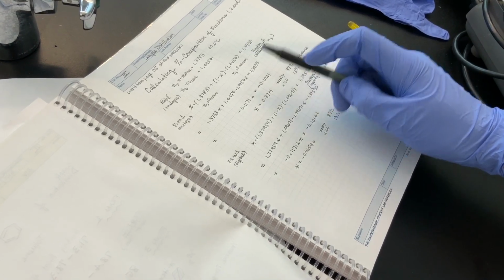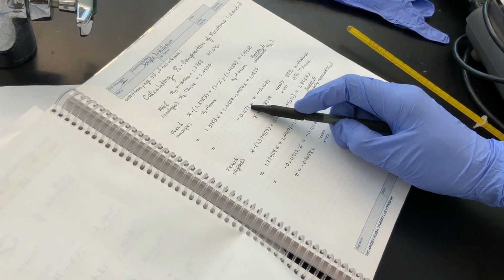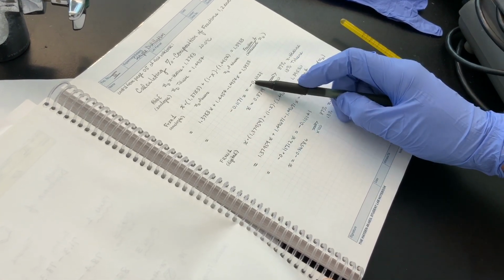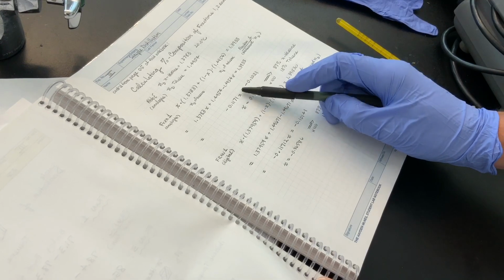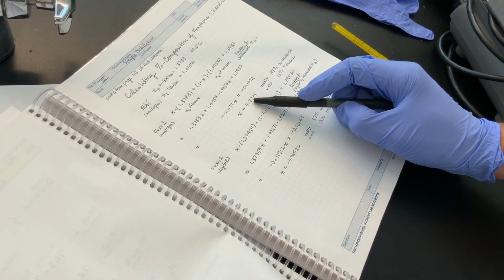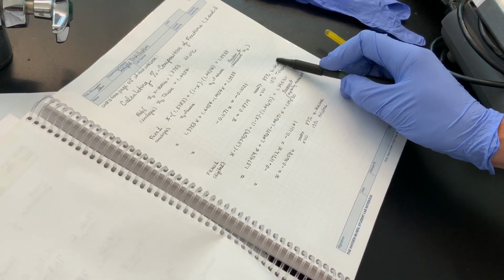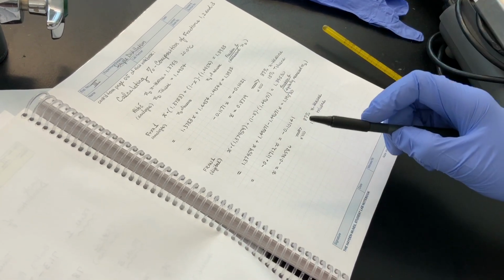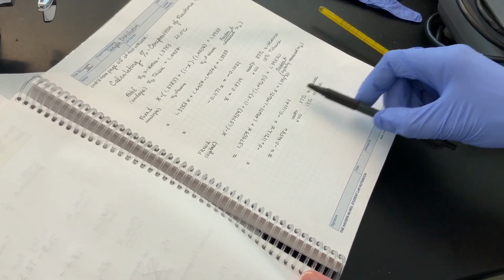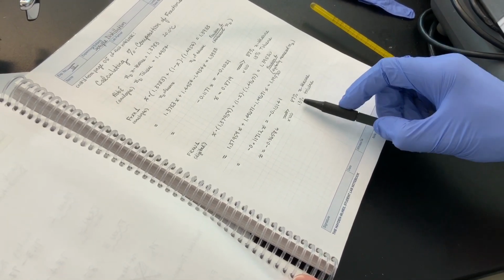Then from there, we subtract 1.4954X from 1.3783X to give negative 0.1171X, and then of course 1.3933 minus 1.4954 gives negative 0.1021. So to solve for X, it's negative 0.1021 divided by negative 0.1171 to give you 0.8719. Multiply by 100 and you get a percentage, approximately 87% normal hexane and 13% toluene, right? So this is a decent separation for fraction 1. And the arithmetic worked out to be the same for the digital. We still got the same ratio, 87% hexane, 13% toluene.